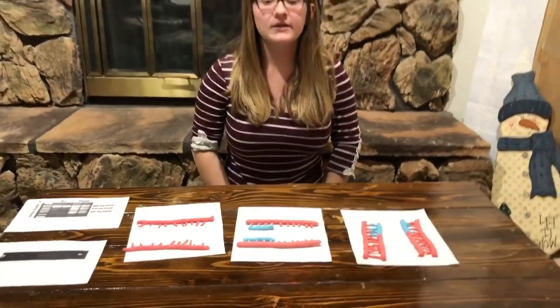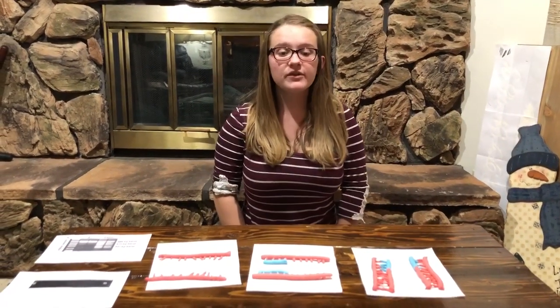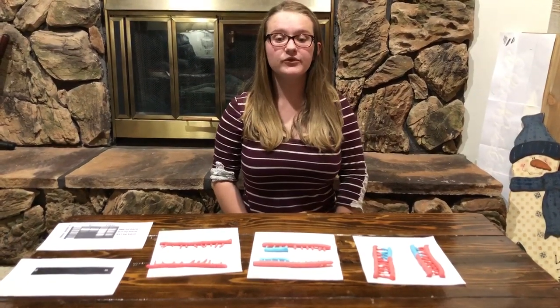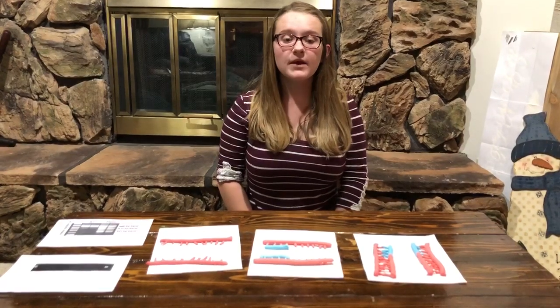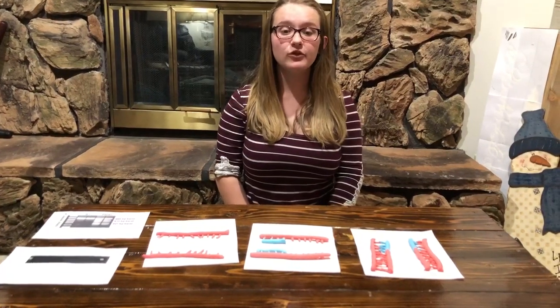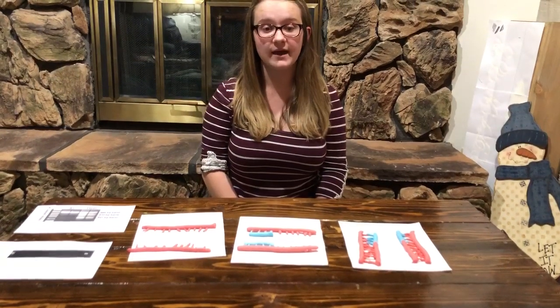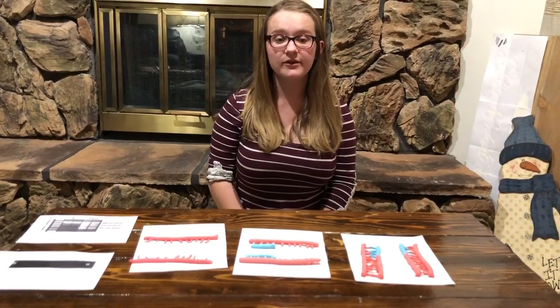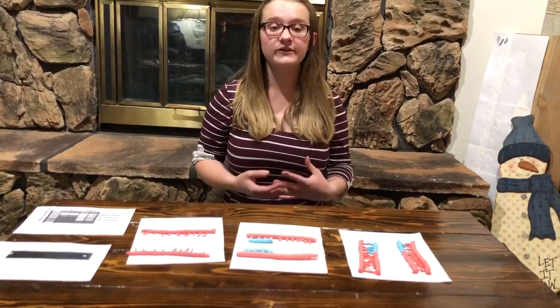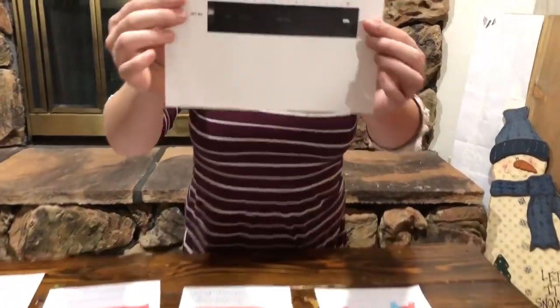The differences between the PCR processes are the way they are collected, compared, and measured. Most of the time, scientists use agarose gel electrophoresis to view and be able to compare DNA strands. When they use the process of agarose gel electrophoresis to view the results, they have 2 options: add ethidium bromide or some type of fluorescent dye. Qualitative PCR uses this method to view its results. Qualitative is mainly used to discover if DNA is present in a sample. This is what qualitative would look like.